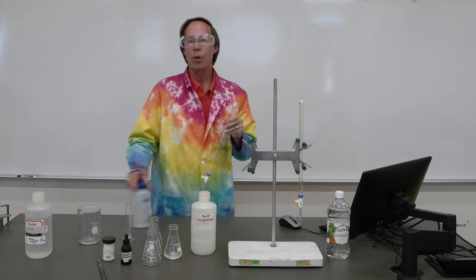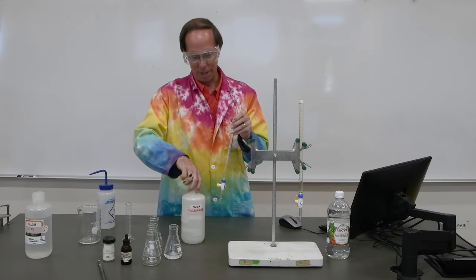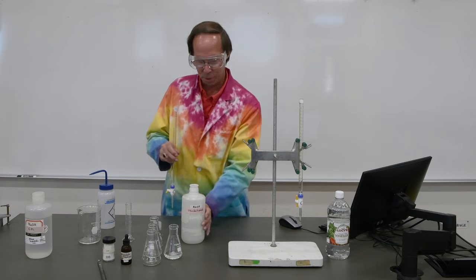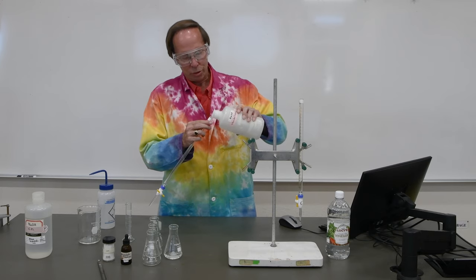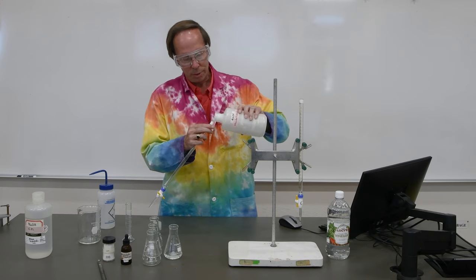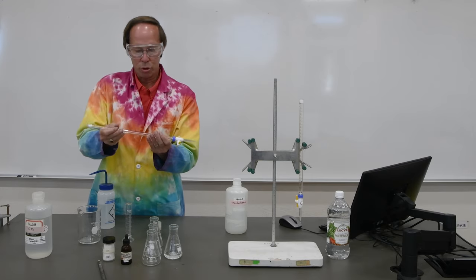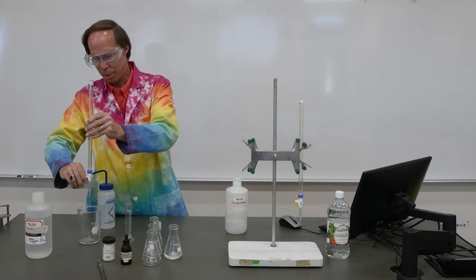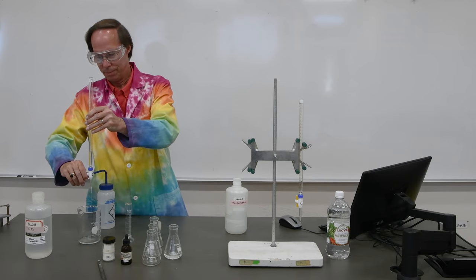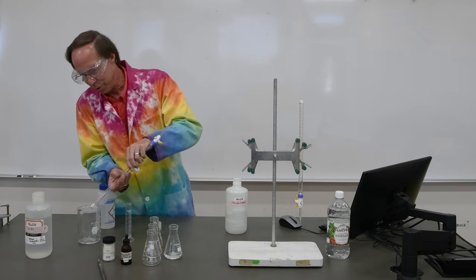Now we're ready to prepare our sample of sodium hydroxide. So this is our soon-to-be standardized sodium hydroxide. I've already taken the liberty of writing standardized on the bottle. So we'll go ahead and put a little bit of this in here to start so we can rinse it out. There we go. We'll swirl this around a little bit, make sure we get all the deionized water out of here. Go ahead and let it drain through. And then we'll drain the rest of it while we swirl it out the other side.